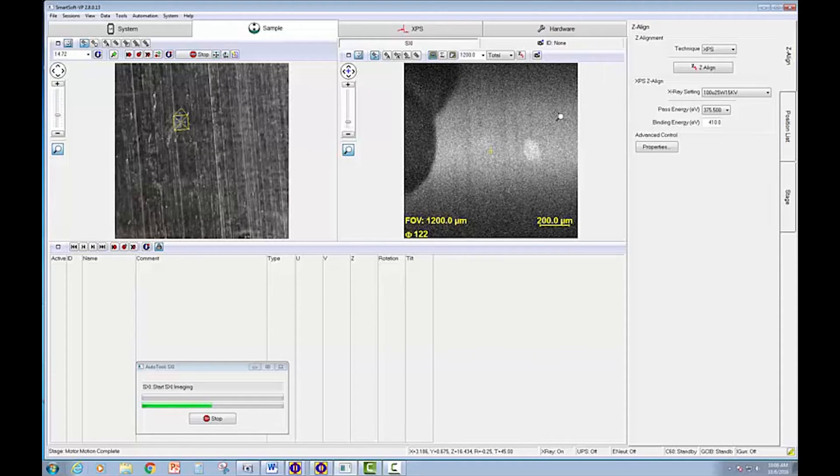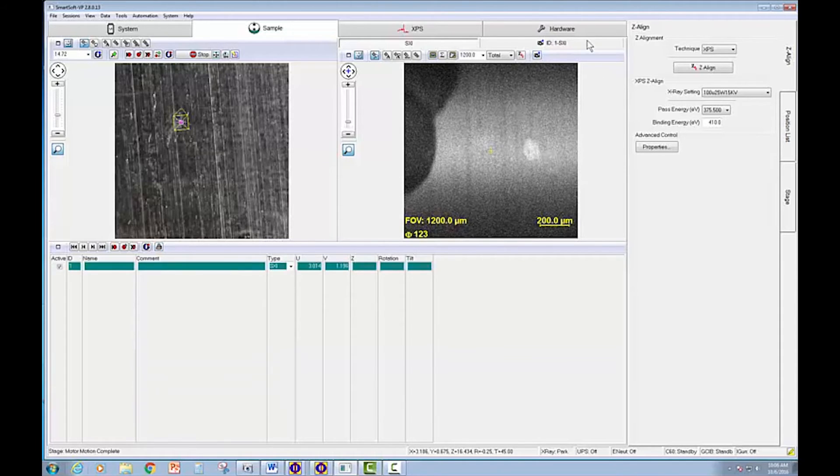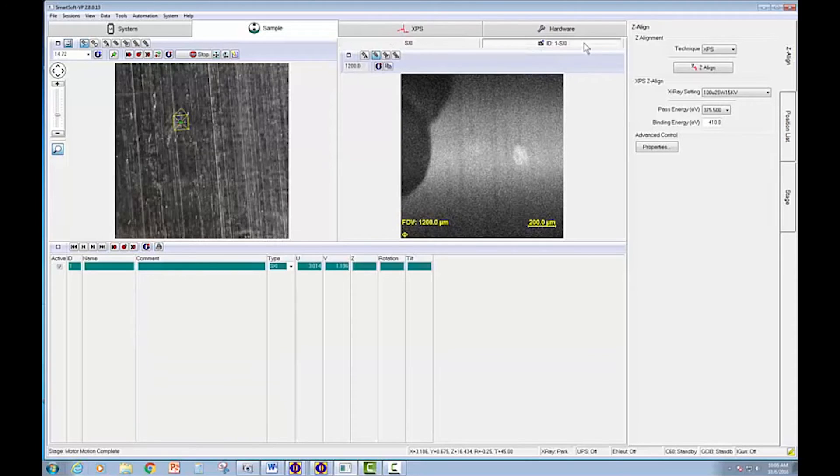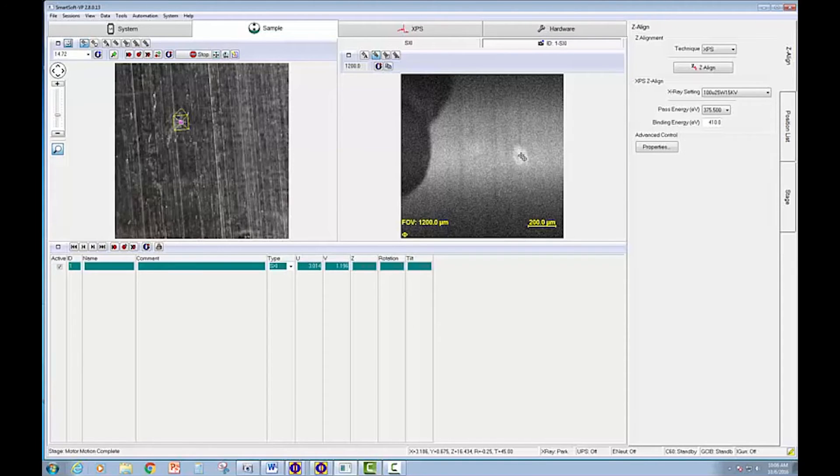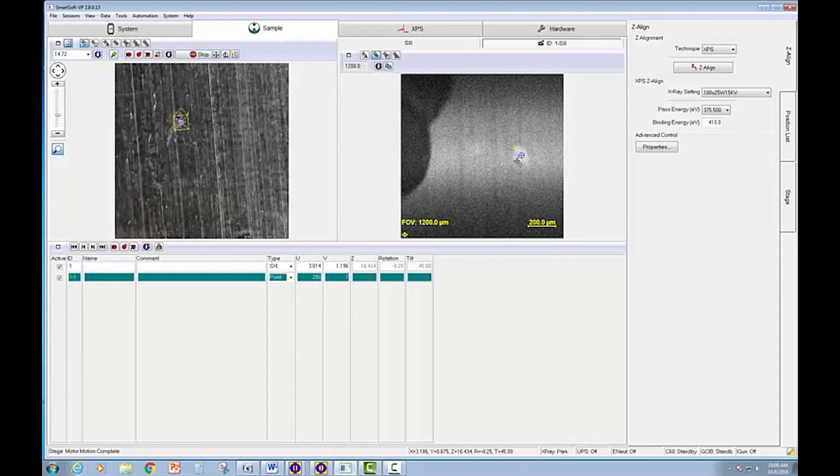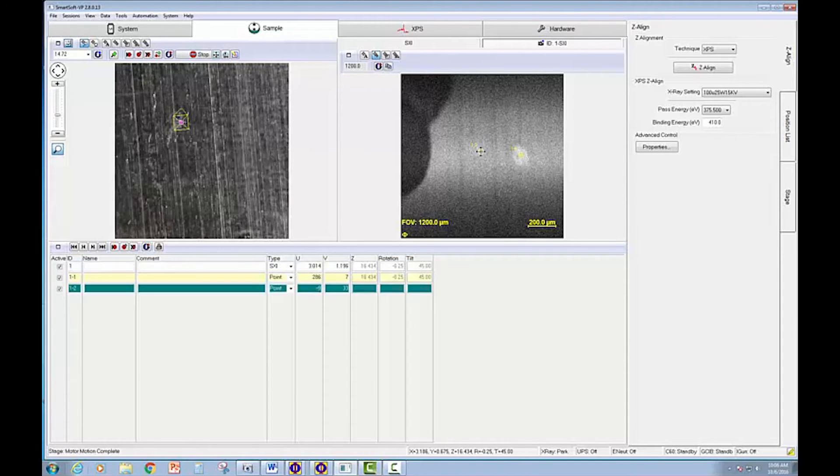So I'm now going to save the SXI image and display the saved image. And I'm going to define three points. One on this bright feature. One on the kind of average area. And one on the dark feature.